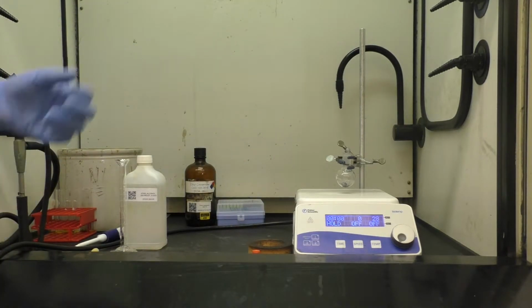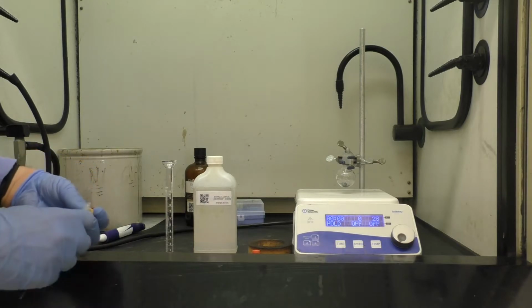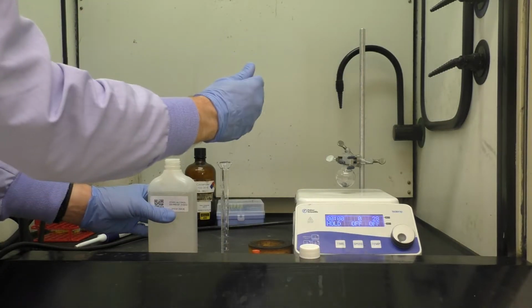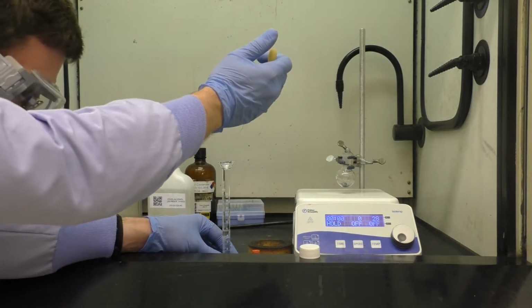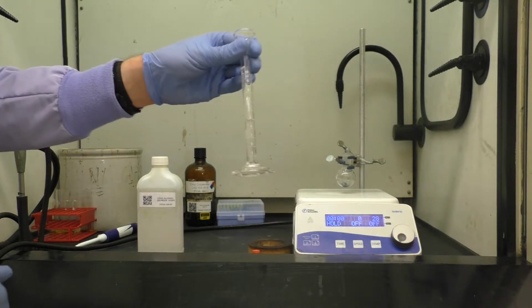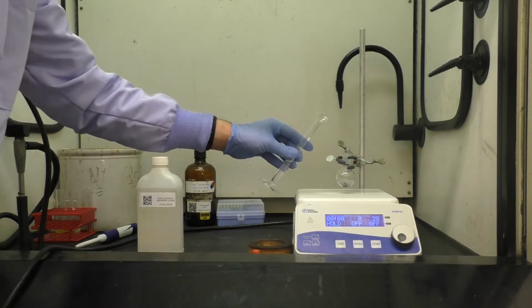I can then add 5 milliliters of ethyl alcohol, using a Pasteur pipette. We've measured out approximately 5 milliliters. Using the graduated cylinder, we can add that directly to the round bottom flask.